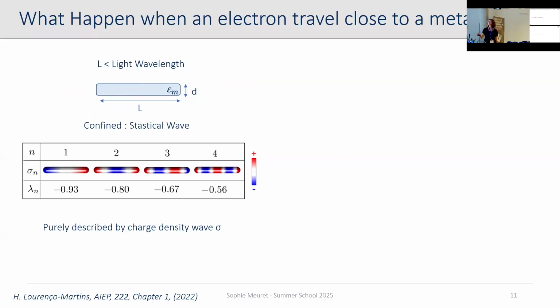It's going to be very close to a quasi-static kind of behavior. And because of this, it is completely connected to the geometry of your material. So what you see here is a decomposition of the different wavelengths depending on the eigenmode of your structure, just taking into account the geometry. And you see different geometries giving you different charge densities.